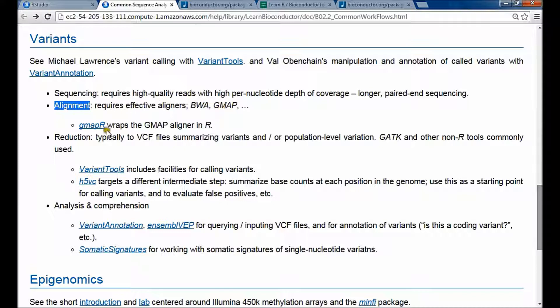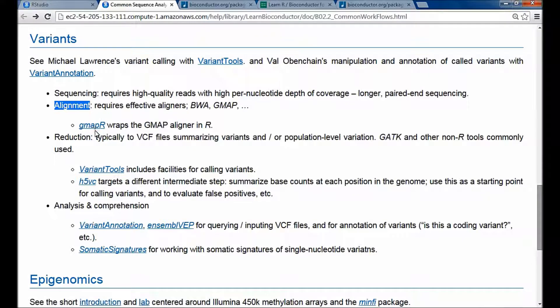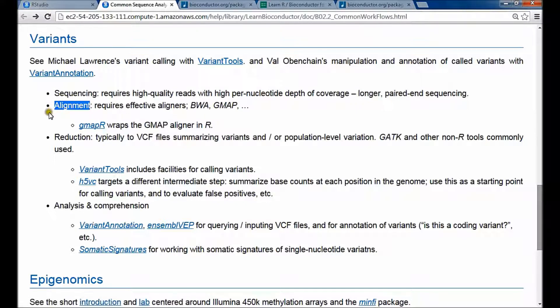Within Bioconductor, you typically do these alignments outside of Bioconductor. But actually the GMAP aligner is wrapped in an R package called GMAP-R, so you can incorporate these really nuanced alignments using an R package.